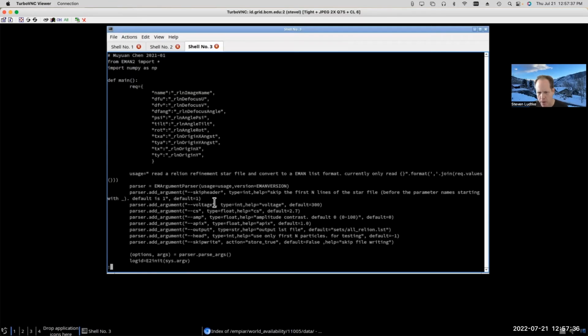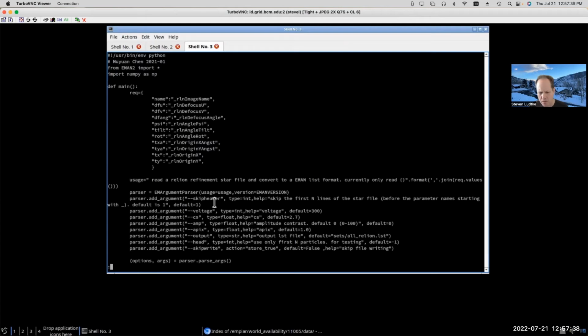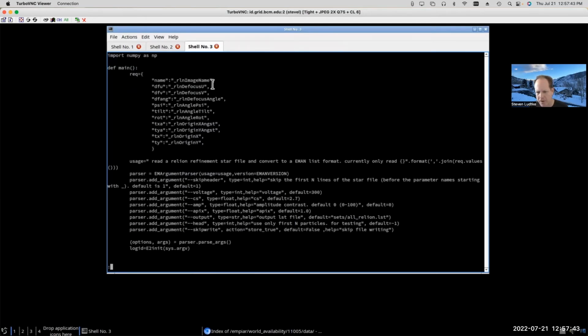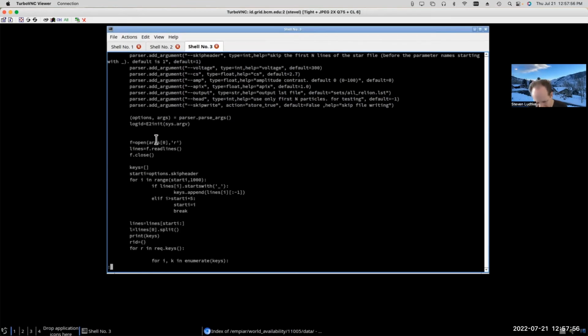All right, I'm not sure where he did it. Maybe he... Oh, I see. Okay, you can see here, here's where he's defining, he's made a little translation dictionary, I guess, because he didn't like typing this. So he made a little translation dictionary for the Relion header names into shorter versions of the names.